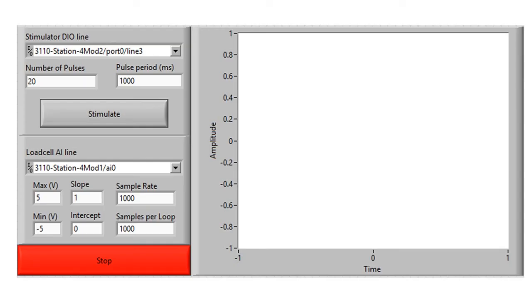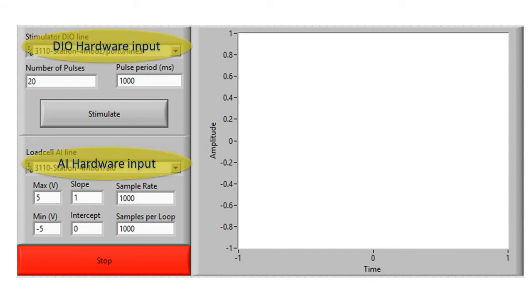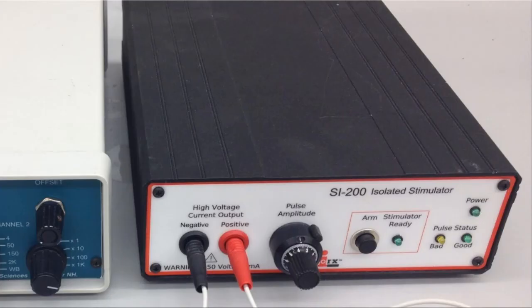Make sure that you're connected to your Ethernet DAC via Measurement and Automation Explorer. Enter the correct hardware lines for both the load cell and stimulator. Set the total number of pulses to 20 for this example and the pulse period to one second, so we can visualize the pulses on the stimulator.